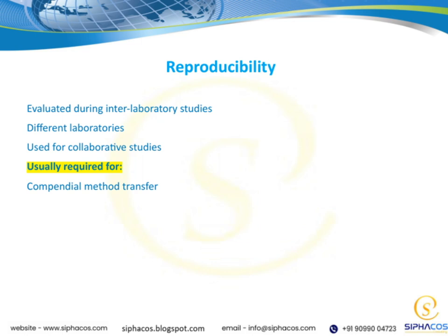So, overall, reproducibility helps us build confidence that our methods are robust and can be reliably applied in different labs and situations.